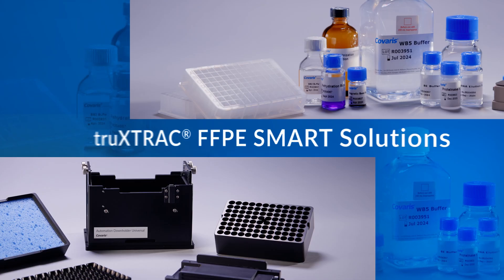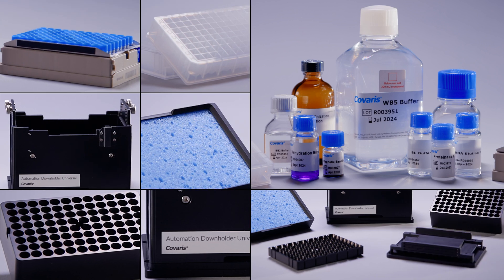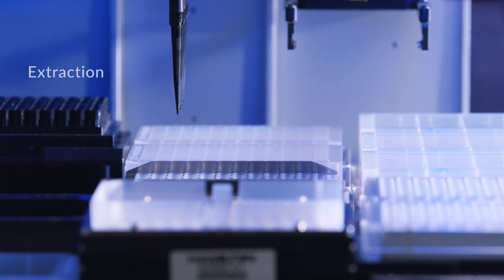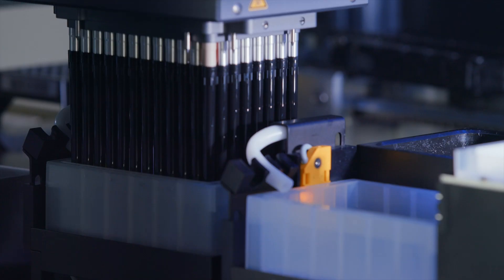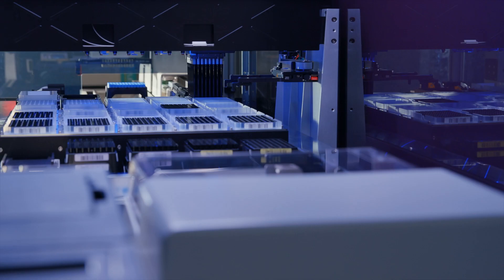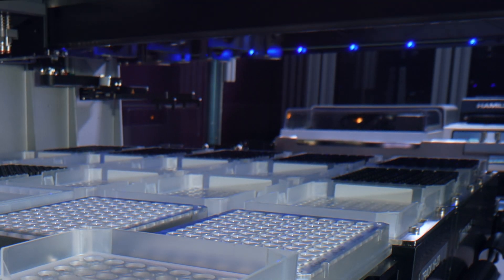Introducing Kovaris TrueExtract FFPE Smart Solutions — the scalable approach to deparaffinization, extraction, and purification of both DNA and RNA from the same FFPE sample in an automation-friendly, highly adaptable workflow.